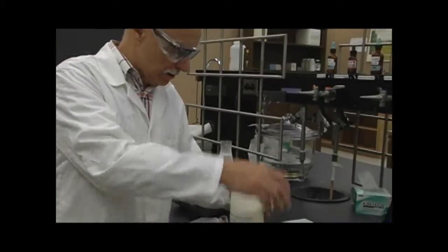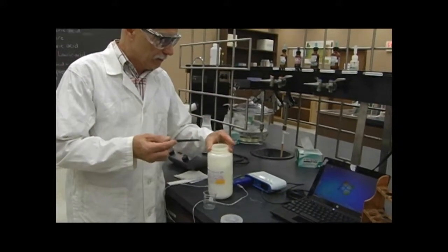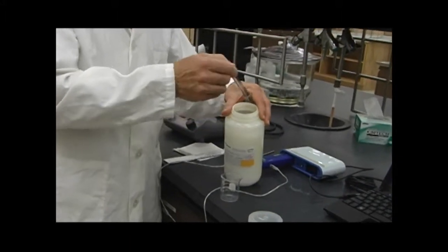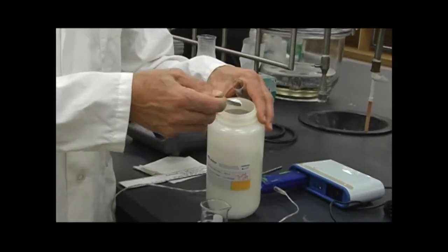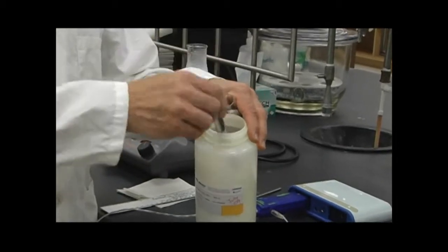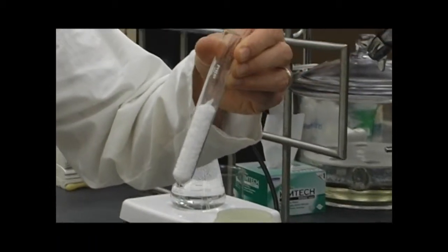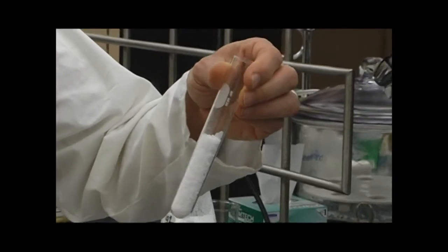So obtain your small test tube and carefully place about 3/4 of the test tube of lauric acid. It's not critical how much you put in, it's critical that you weigh it. So put about that much, so maybe that's 5/8.